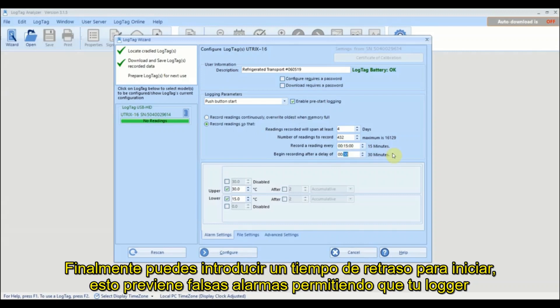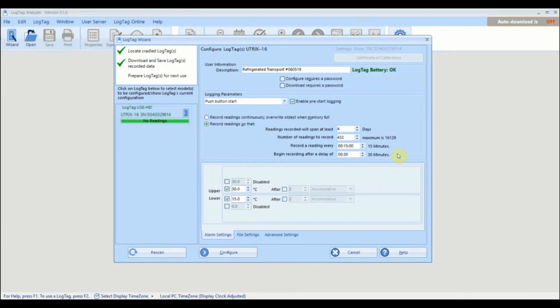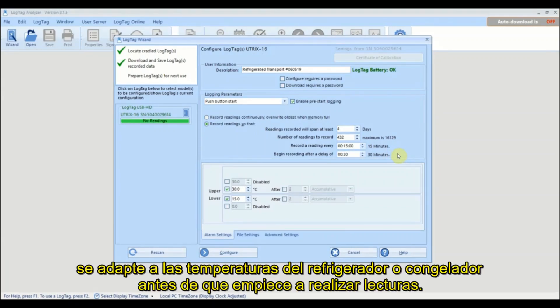Finally, you can enter a start delay. Adding a start delay prevents false alarms by allowing your logger to adjust to the refrigerator or freezer temperature before recording starts.